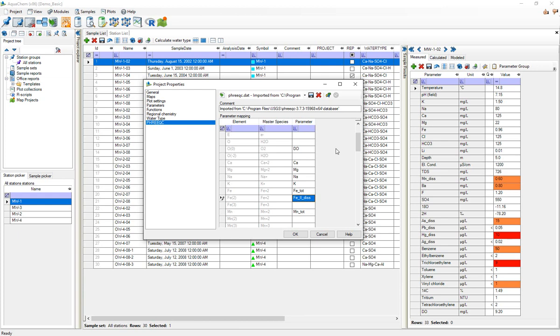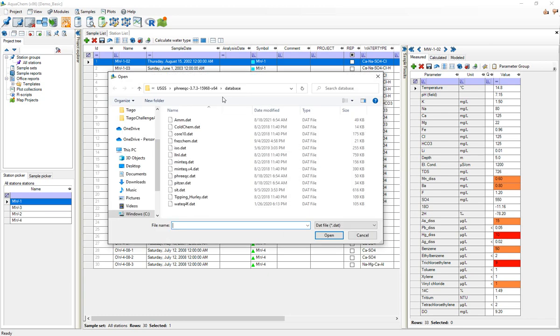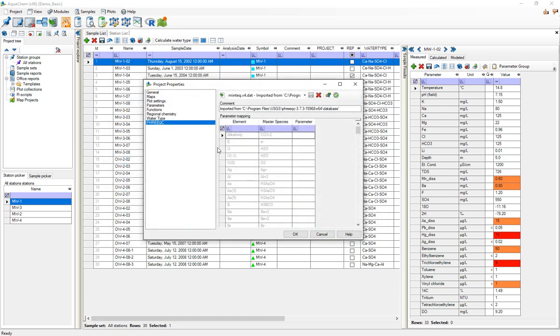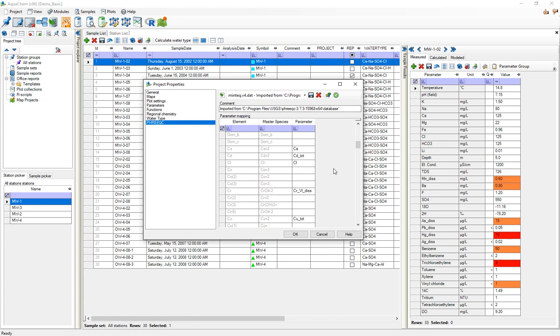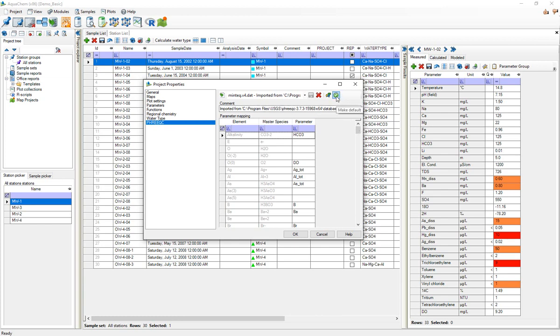So I save a database by pressing the save button here and I can actually have more than one database associated with a project. So if I want to use another database for modeling I'd select the import button again and select some other database, so I'll do the MINTEQ v4. I'll open it and I can do the same process of mapping parameters and saving it. If I want to make this default database I'll just press the make default button right here. If it's the default then it would be the database that would be used when doing the one button modeling.